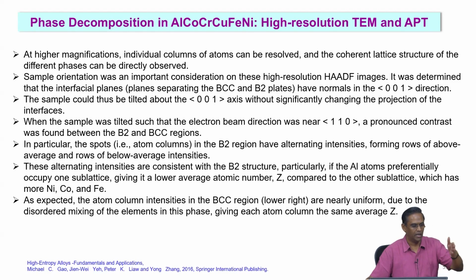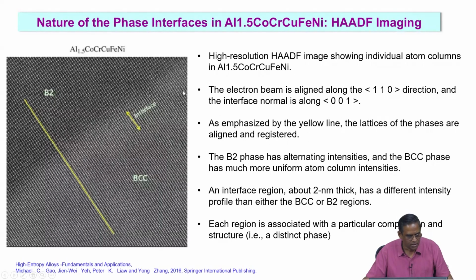So I can look at these atomic columns, whichever is brighter, and relate them with their corresponding atomic number. I can do that in these images. So, this is the image I was talking about. I think there is a mixing of the slides.